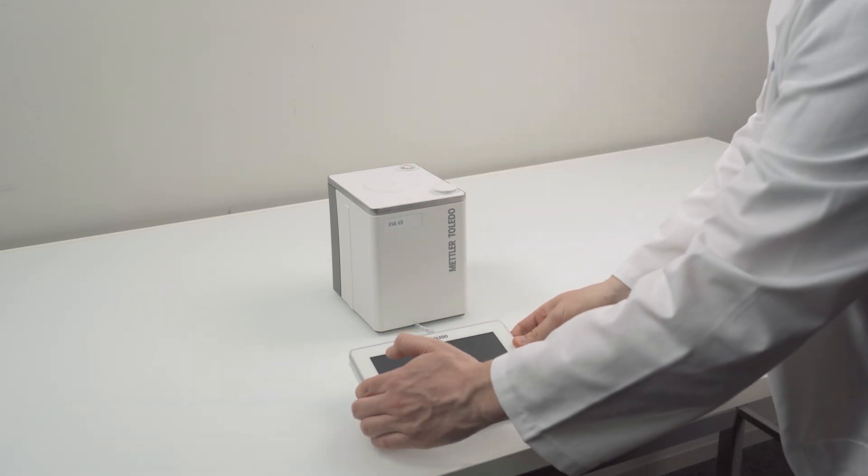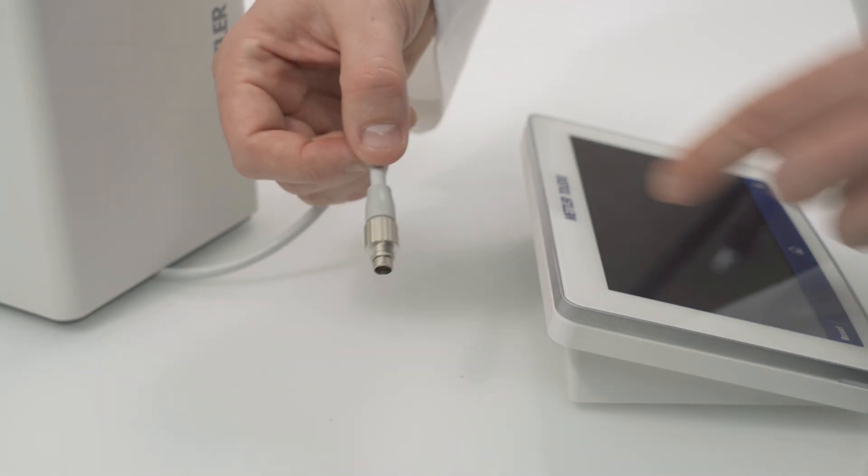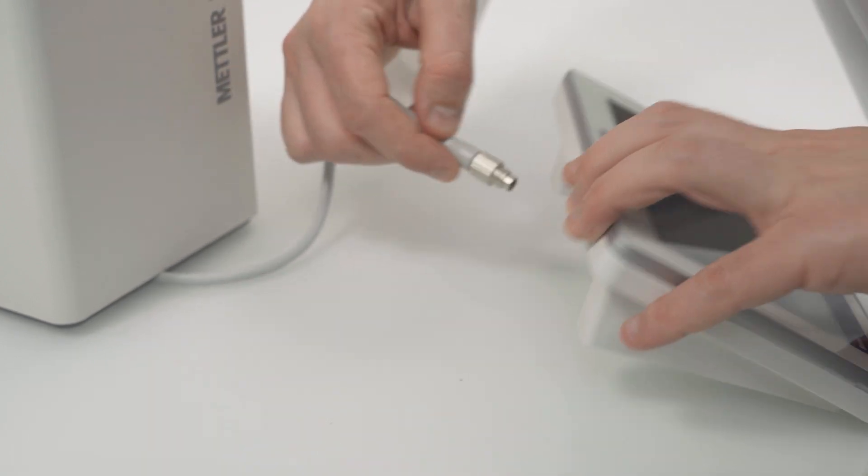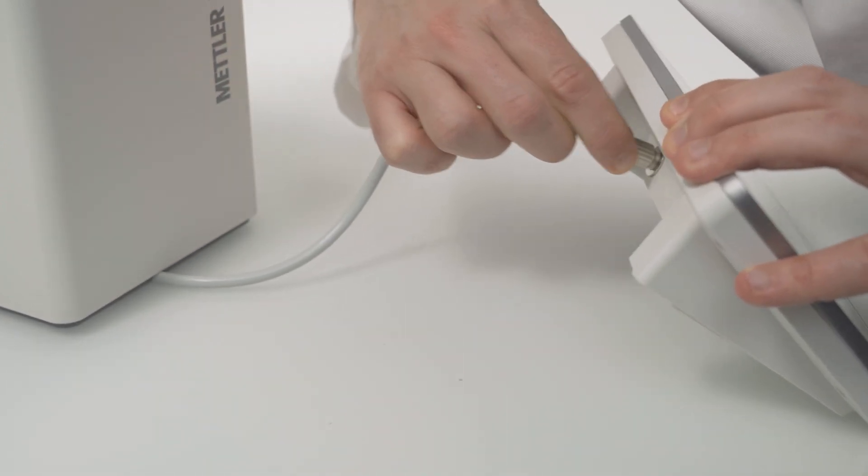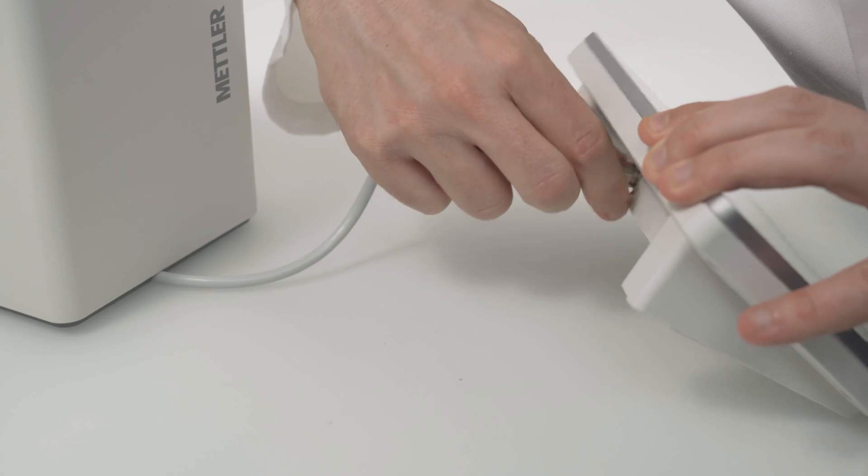Position the terminal in front of the titrator. On the cable you will find a small arrow. This arrow must look upwards to be aligned with the terminal socket. Push it in and fasten it down.